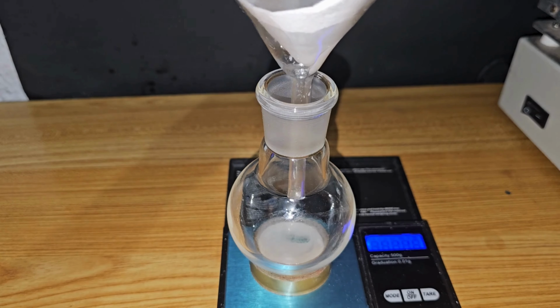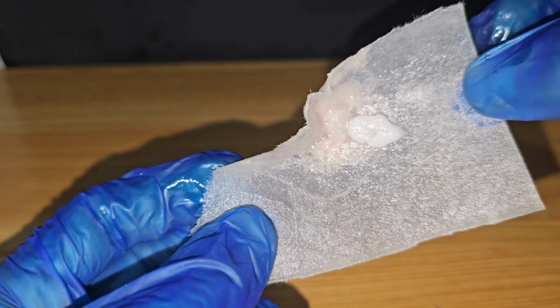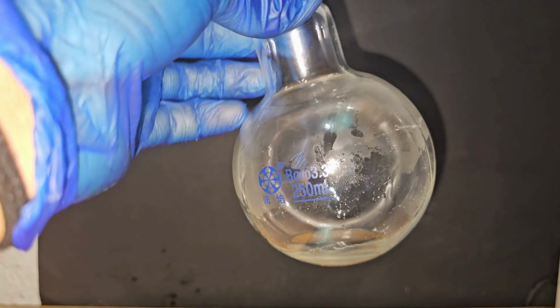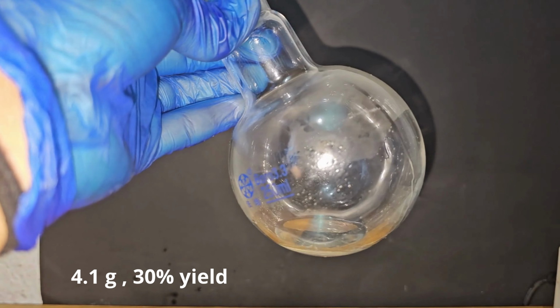but here I committed a horrendous mistake. The filter paper had a small hole in the bottom, so I had to filter it again, losing approximately half of the distillate I got. Very painful mistake. At the end I got 4.1 grams of aniline, which represents a very bad yield of 30%.